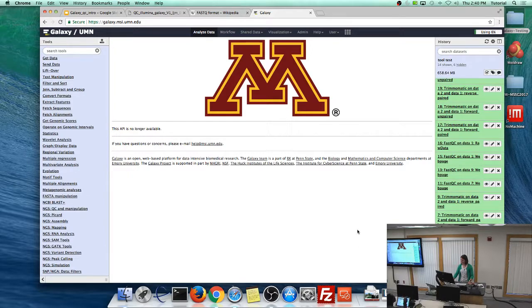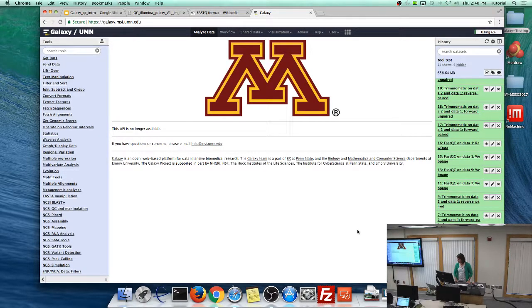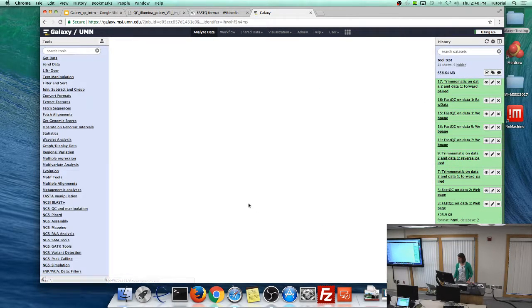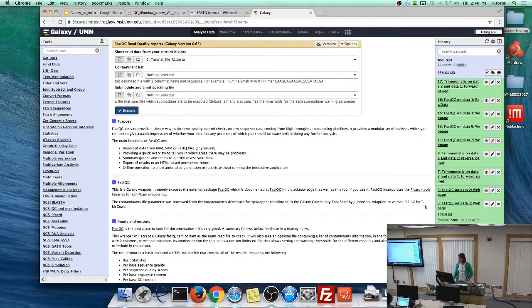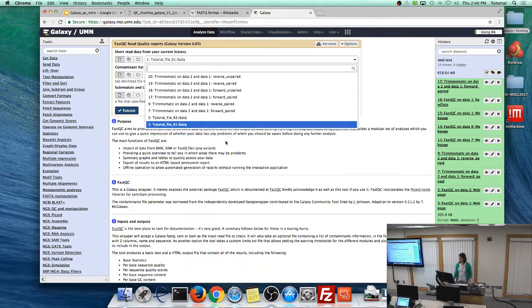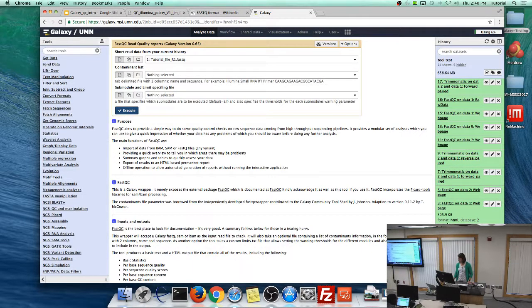You can run FastQC individually on each file for now. You can use the recycle icon on the first FastQC run, then just switch the input to run it again on the second file without re-configuring everything. You can also go back and rename history items using Edit Attributes if you want to keep track of which result is R1 and which is R2.